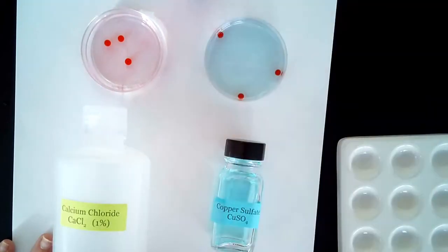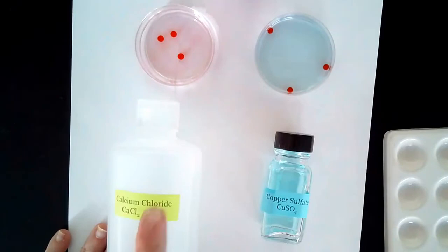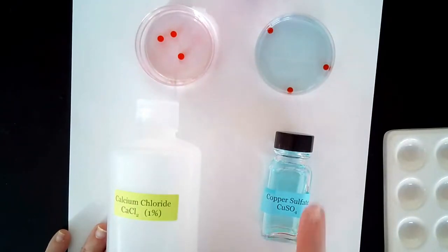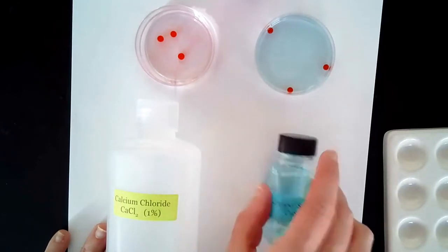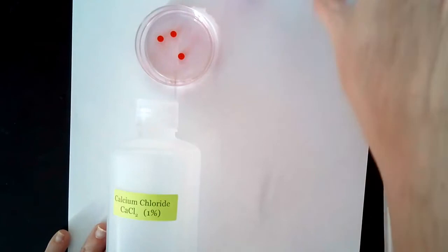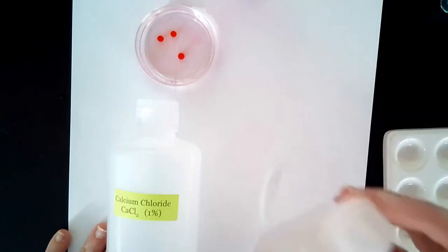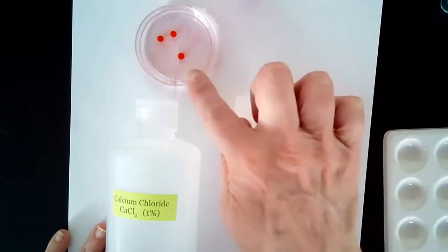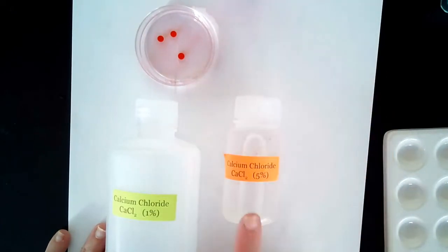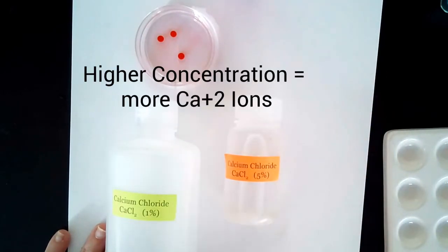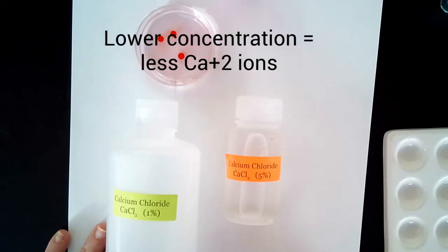You can use calcium chloride to make calcium alginate beads or you could use copper sulfate to make copper alginate beads. Additionally, you have some options for the concentration of the calcium chloride beads. These are one percent but you could also do five percent or you could dilute and make whatever new concentration of calcium chloride you want to use to make alginate beads.